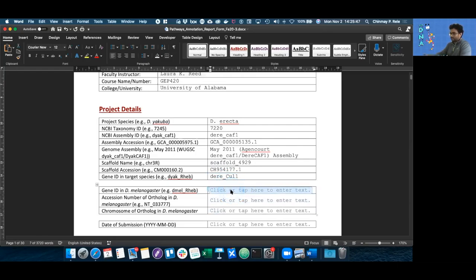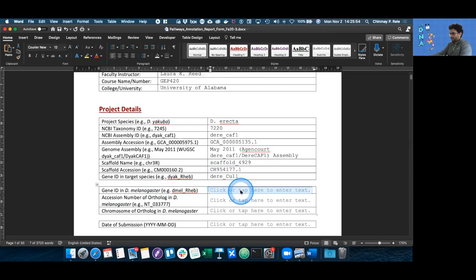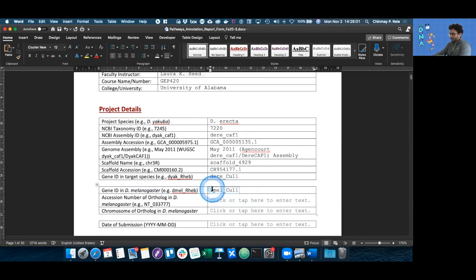Now we have to do something similar to our reference species, which is always going to be D melanogaster. So we can type in D-M-E-L underscore and the name of our gene. Just remember, the D in Dmel should be small.